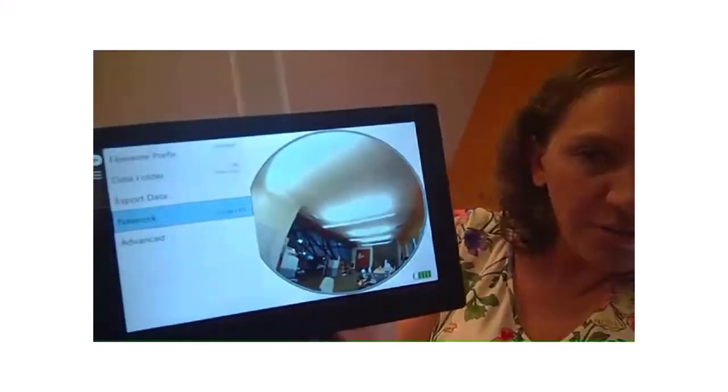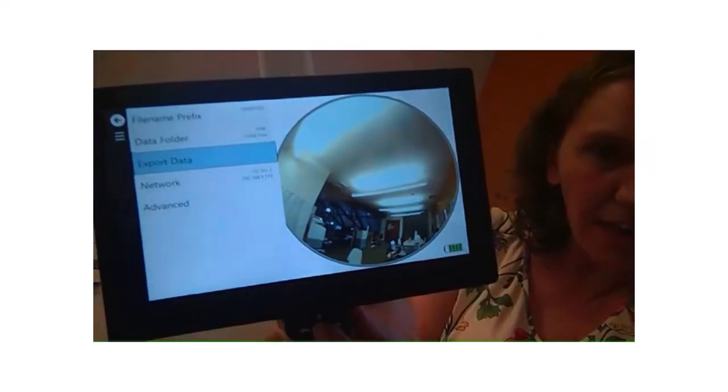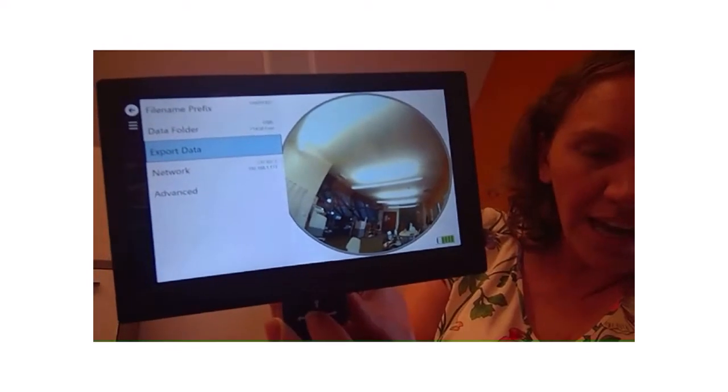And there's an option, I don't know if you can see it there, called Export Data. And that's what creates a CSV file for you to obtain that data off of this instrument. Okay, so that is the number of features, a very ergonomic fit, very user-friendly interface.